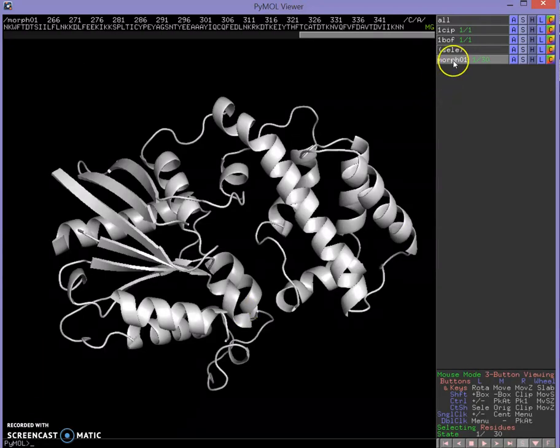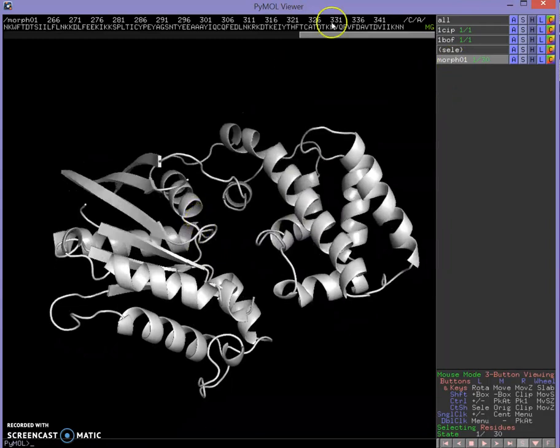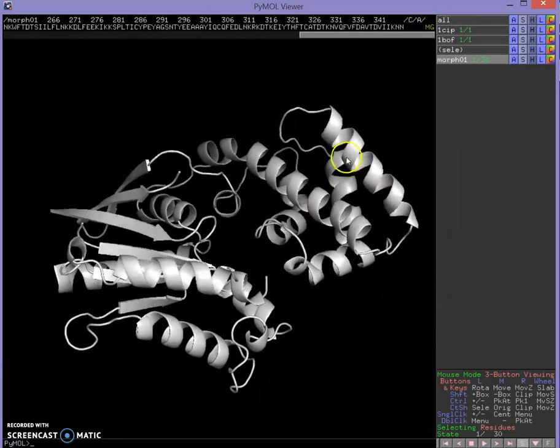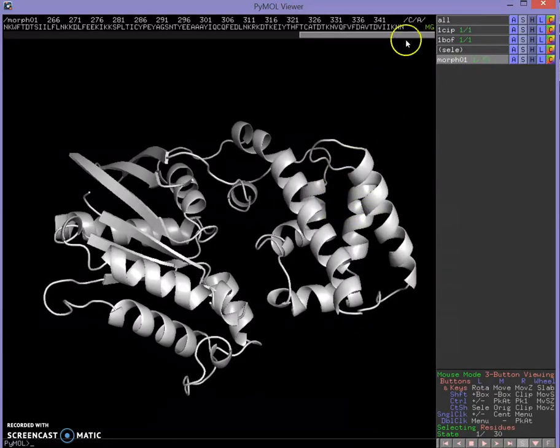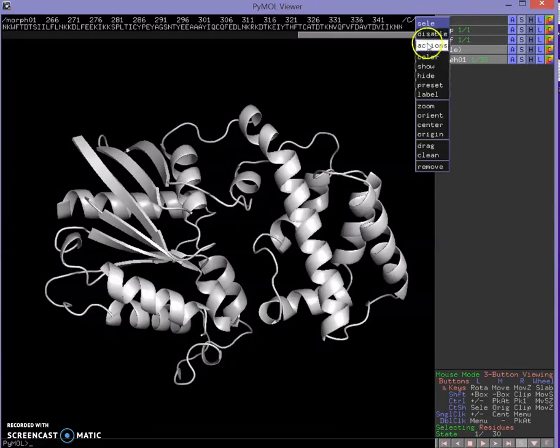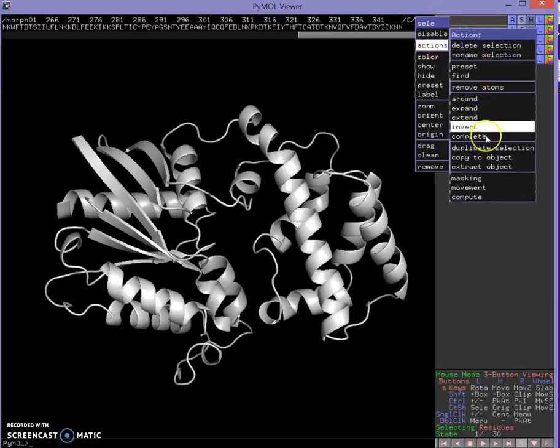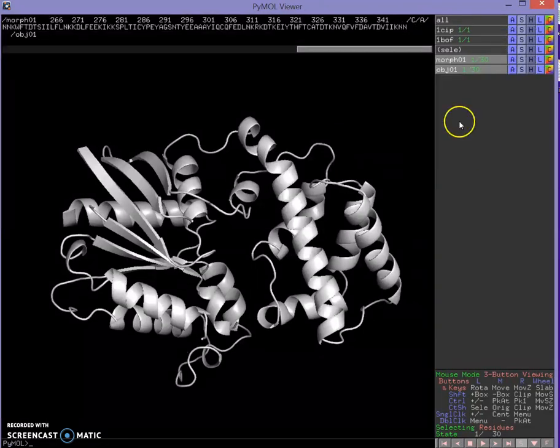Now it's done — we have what's called a morph. We can see the magnesium that we aligned earlier is over here in the structure. What we'd like to do is show some of these as objects so that we can have them move around independently. So we can select this magnesium, right-click, New Actions, Copy to Object — and now we have a magnesium object.